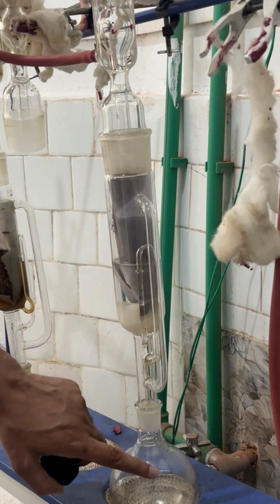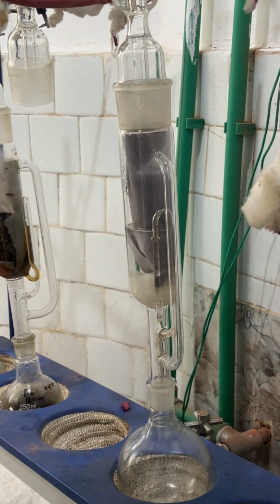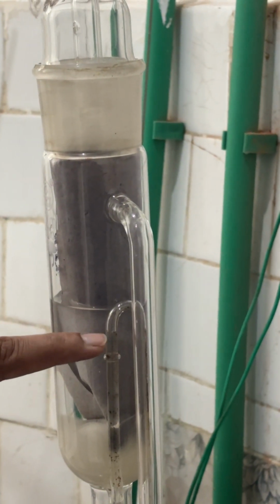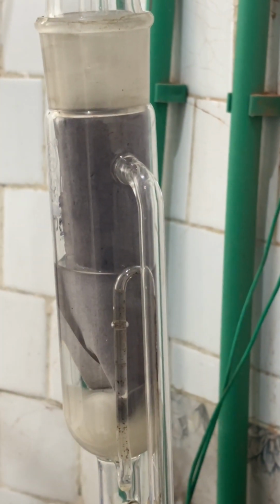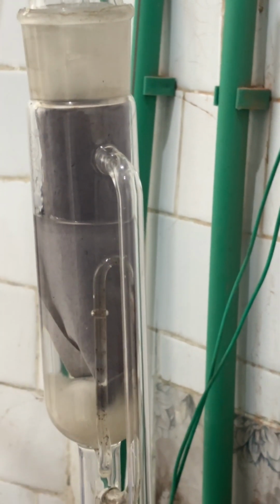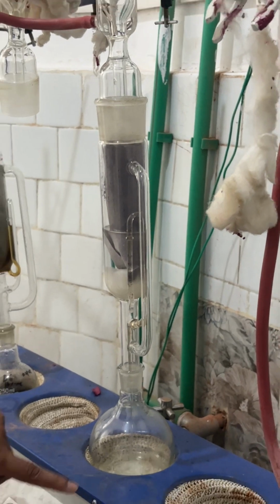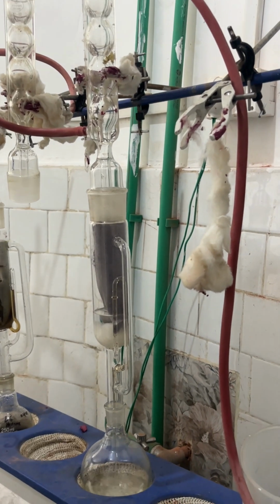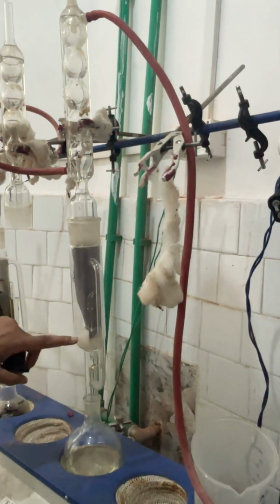So we know the capacity of this is 500 ml. Okay, so that's why we take a larger flask. So it is, you see, maybe a little more, and it crosses, and this will come down into this. So once we put this on, this will evaporate, go from here into this condenser, and the water will be running. So this condenser will condense this solvent, and it will fall back into here, and again it will fill up to here.